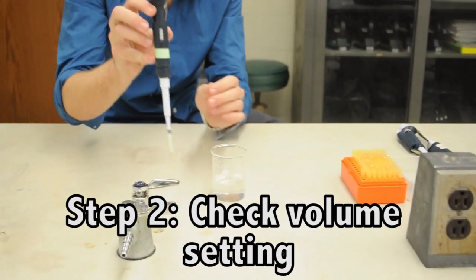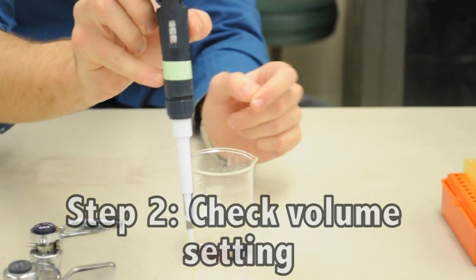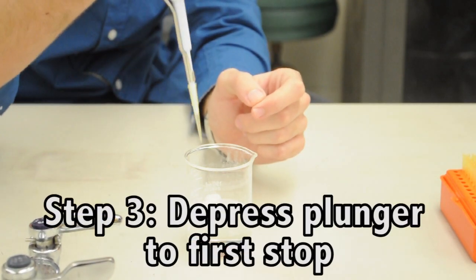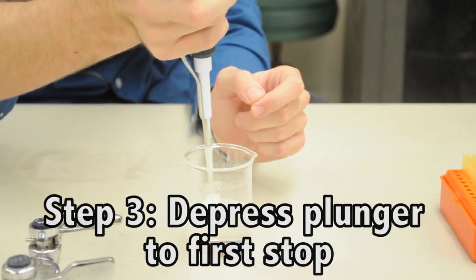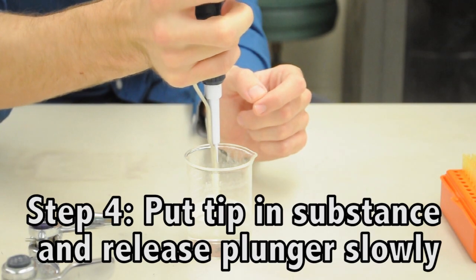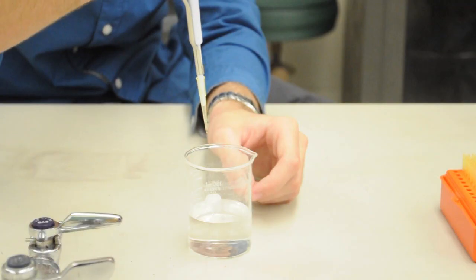You need to then check your volume setting. Right now we're using the P200 at a 100 setting so that will be 100 microliters. You depress the plunger to the first stop and then put the tip in the substance and release the plunger slowly to draw the liquid.